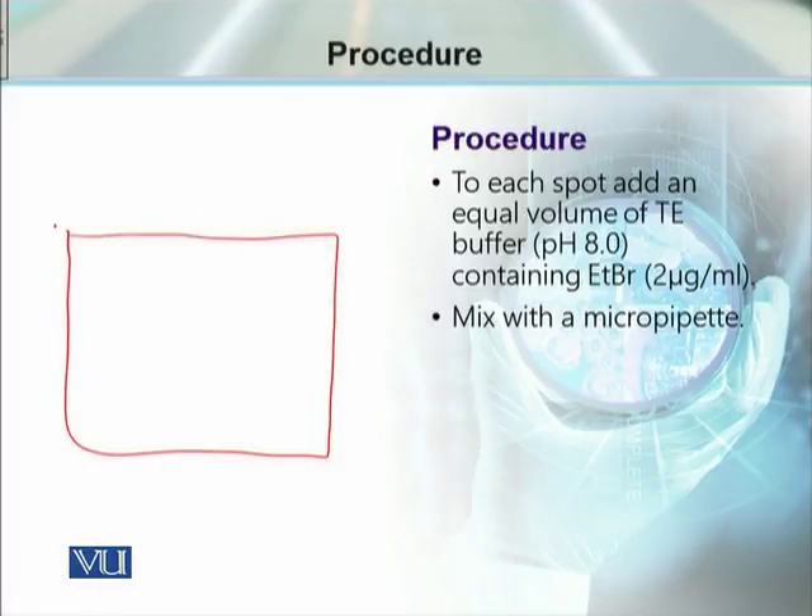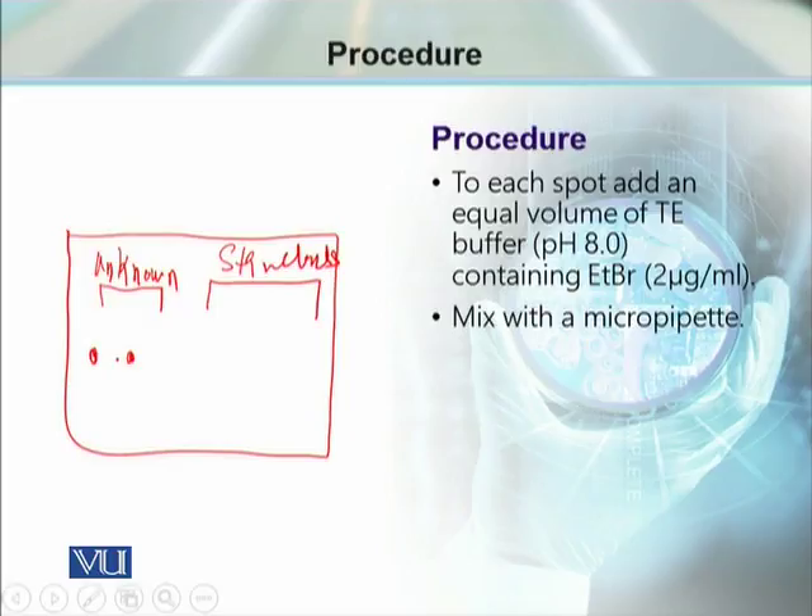As we can see here, this is our plastic wrap. This portion contains the unknown sample DNA, and this portion contains the standards. Marking some spots here — this is the DNA, and these are the known concentration spots. Now adding the ethidium bromide-containing TE buffer.